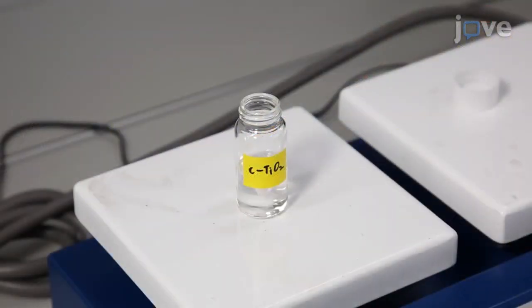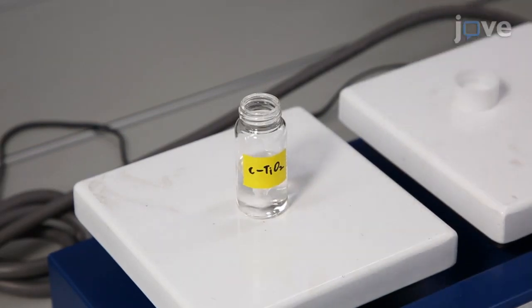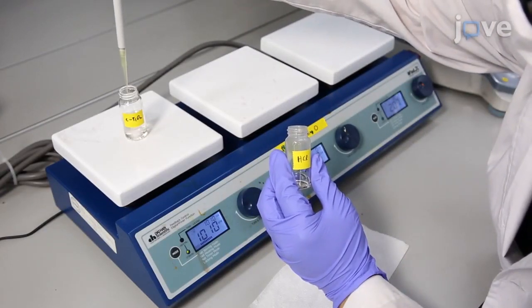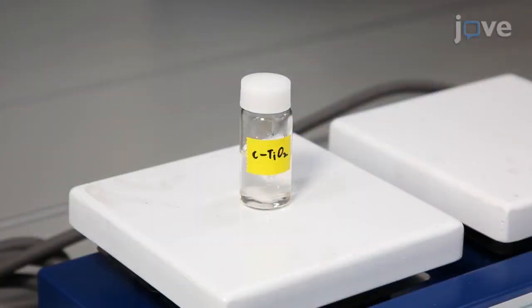Add 0.74 milliliters of titanium isopropoxide to the stirring ethanol dropwise, and then rapidly add 0.06 milliliters of concentrated hydrochloric acid. Stir the mixture for between 12 and 24 hours at room temperature to form the precursor solution.